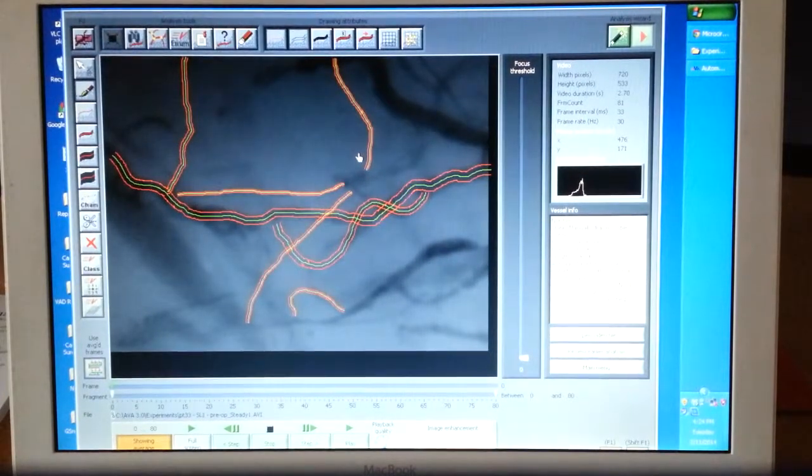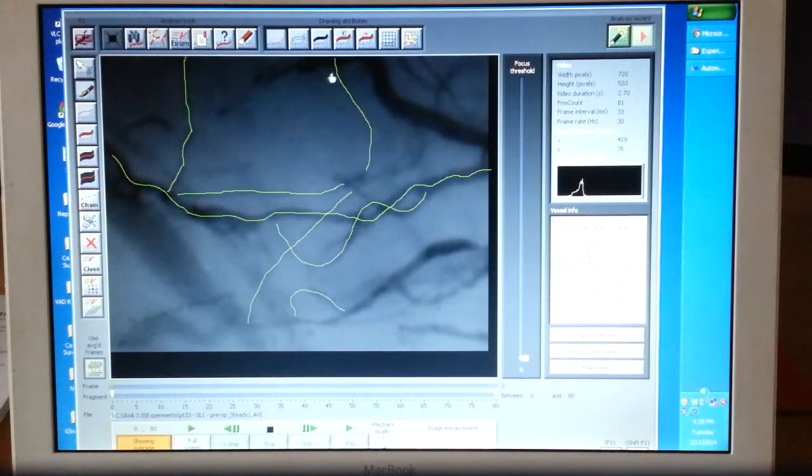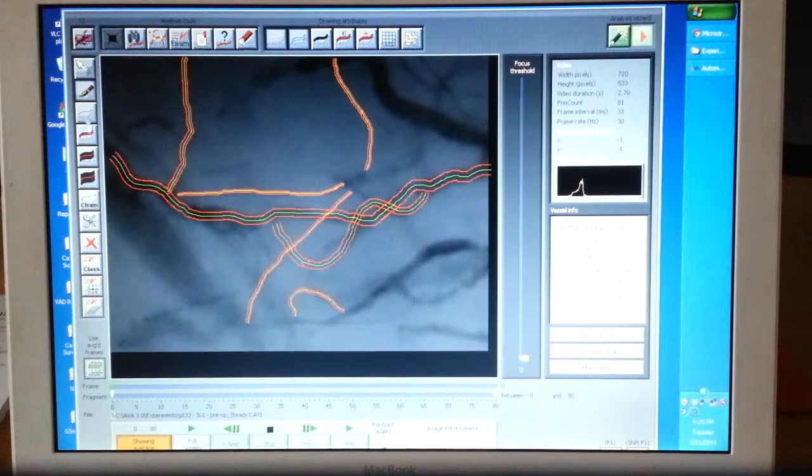What I would recommend doing to make sure that you have successfully drawn everything is to actually remove the vessel walls. So unclick this so you're no longer showing the vessel walls. And you see that now what you actually have is that you're showing just the vessel lines in the middle. And there will be different colors also. I'll just demonstrate to you.